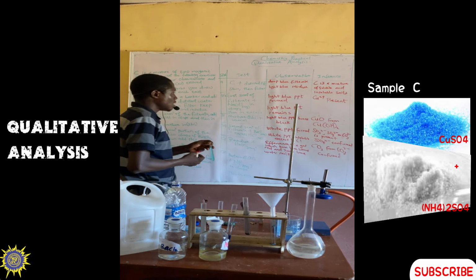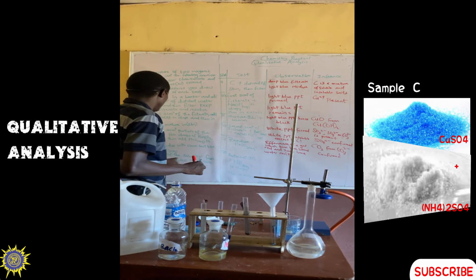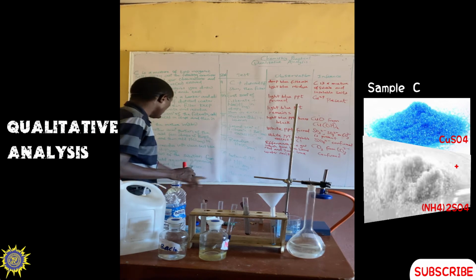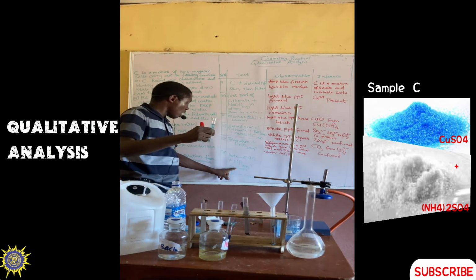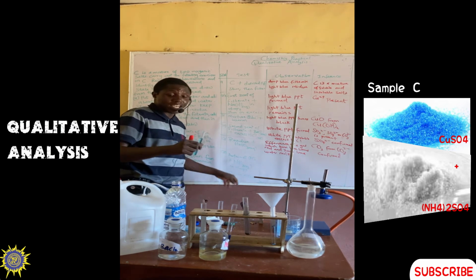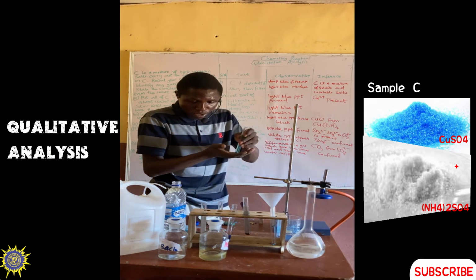So that's that about that one. Now the next thing is to what? They said, to the portion of 2Ci, add aqueous ammonia in drops, then in excess. Add aqueous ammonia in drops, then in excess to the portion of this.